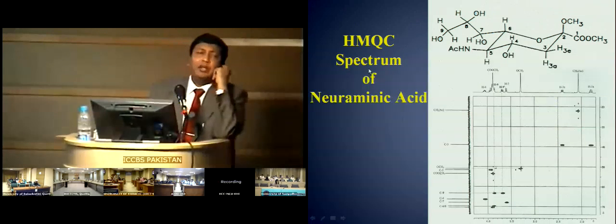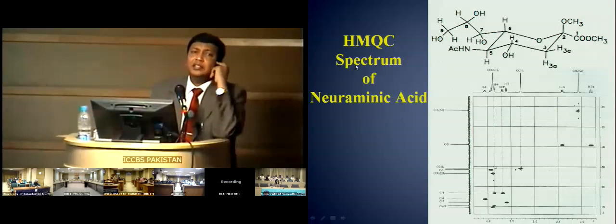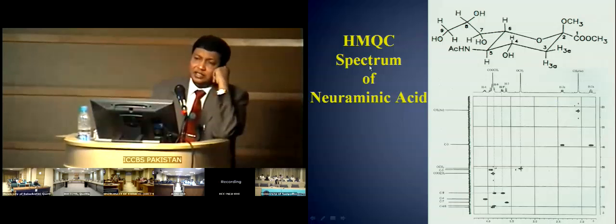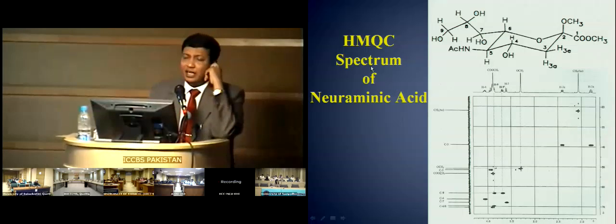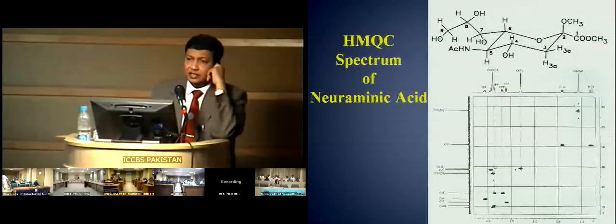Actually, you can record it both for proton and carbon. But HSQC was traditionally developed for proton-nitrogen NMR spectroscopy. You can do exactly the identical procedure for proton-carbon. There would be no difference in the spectrum. As I said, they're essentially the same technique.